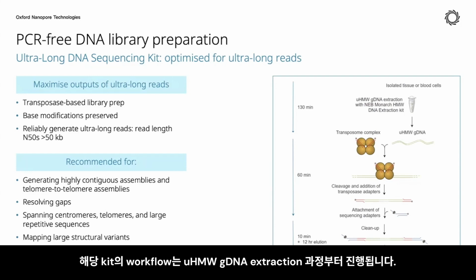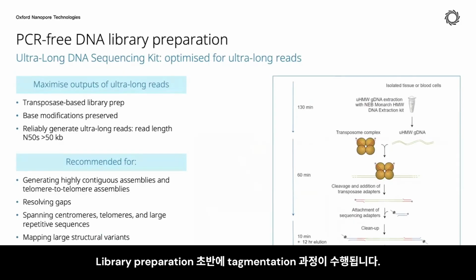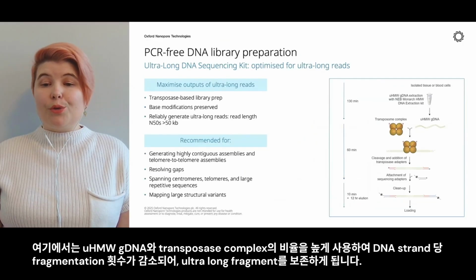The workflow starts with extraction of ultra-high molecular weight DNA. At the start of library prep, a tagmentation step is performed. Here, a high ratio of ultra-high molecular weight DNA to the transposase complex is used, resulting in fewer cuts per molecule and retaining ultra-long fragments.